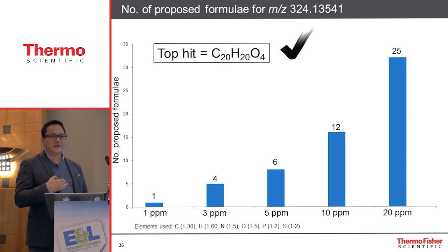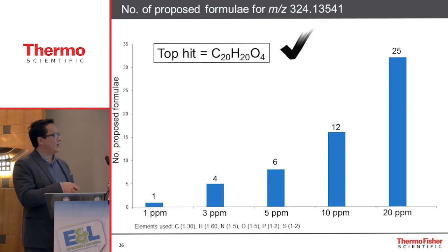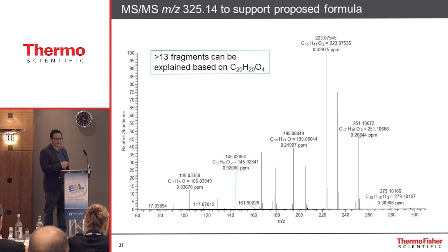So I've gone on about the mass accuracy for a long time and probably repeatedly, but this is the real true value, because that mass accuracy on most instruments on the market would sit around 6 to maybe 10, some around 20 ppm on time of flight instrumentation down at these low molecular weights. In reality, at 1 ppm, the analysis of this unknown really would give you only one elemental composition. So within the period of a few seconds, you have a very high confidence elemental composition result to work with for an unknown that's not in your library.